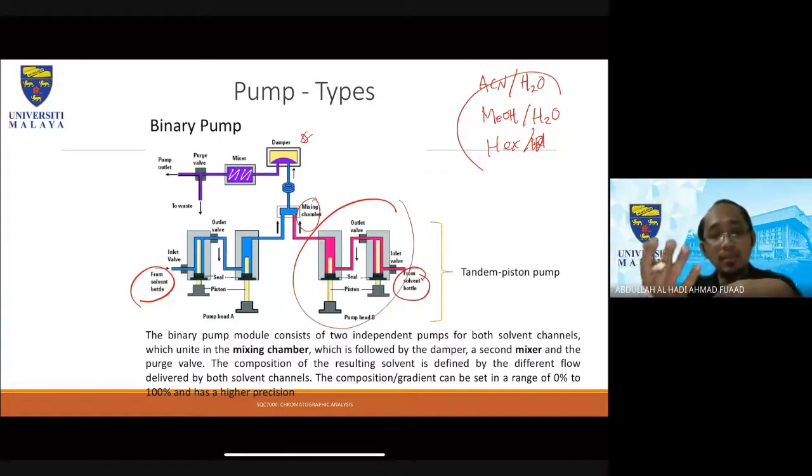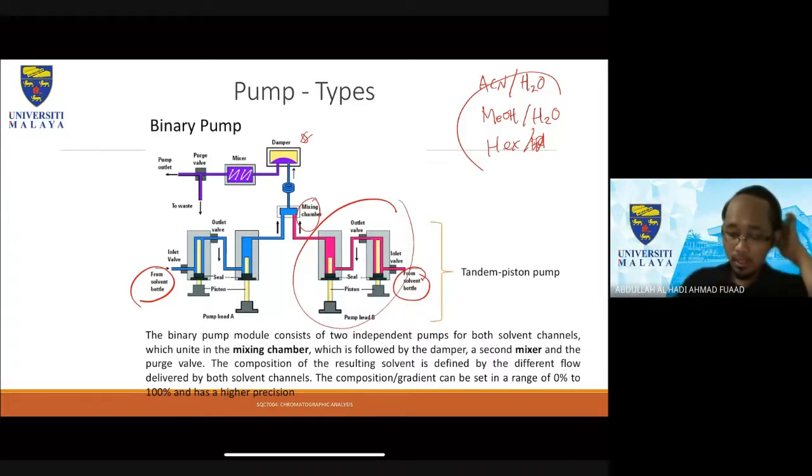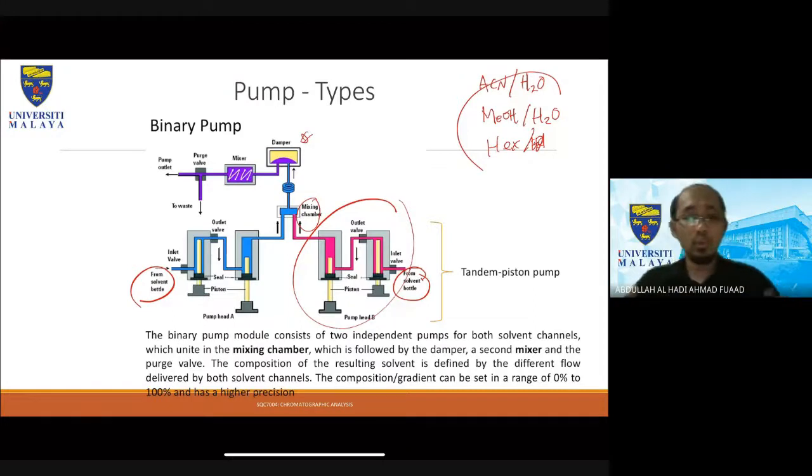But say, for example, I'm using a more universal detector like UV-Vis. If I have a different retention time, then it might suggest a different peptide, not J14. Okay, so that's another reason why sometimes you want to find literature information first before you run your first sample.